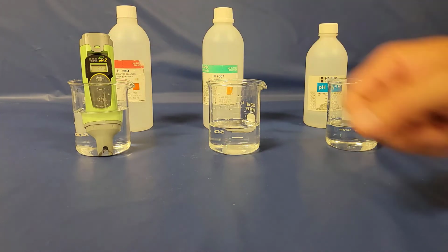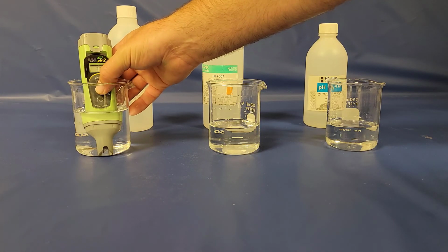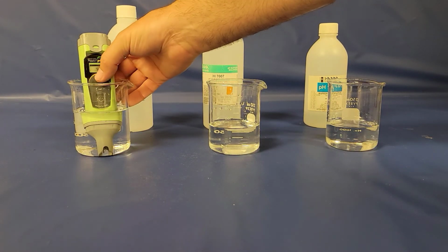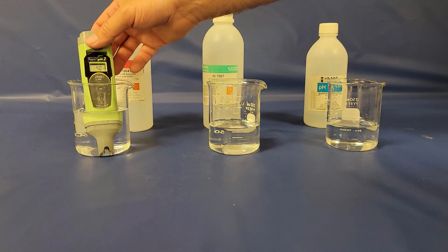You'll notice in this case it's a little bit lower than 4, so we're going to calibrate it to 4. So we're going to hit the calibration button. It says it's calibrating. The sensor knows that we're trying to calibrate to 4, so we go ahead and tell it, yep, that's what we want, is 4. So we hit enter, and so now it's calibrated to 4.